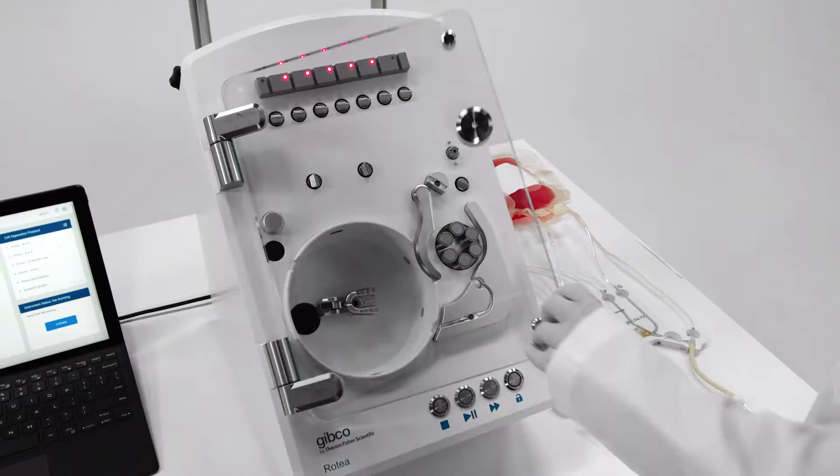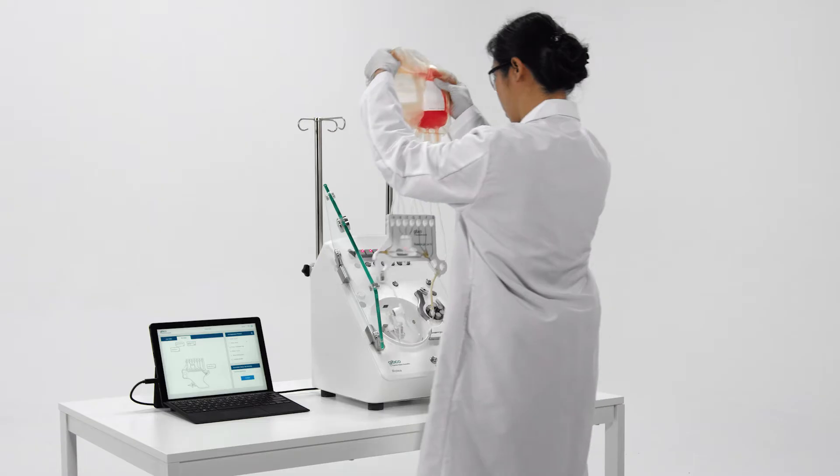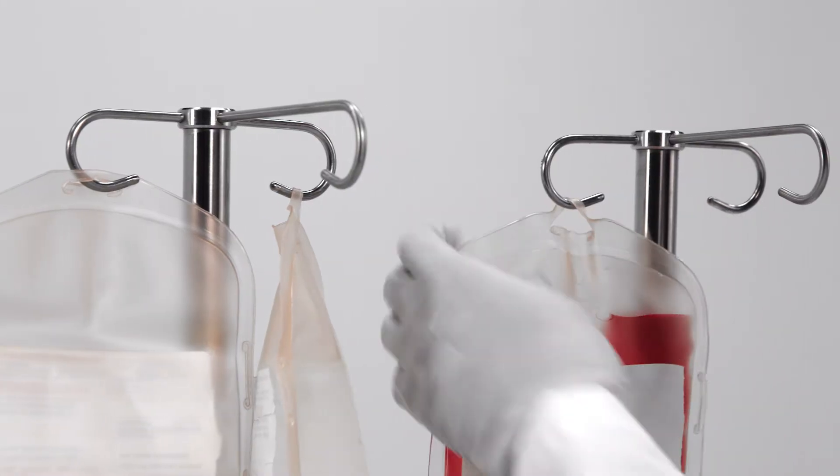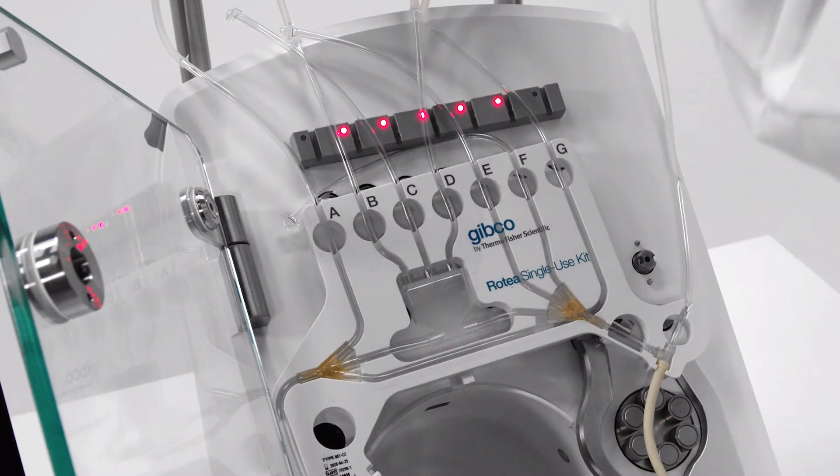Third, load the single-use kit. Start by hanging the bags in an order that best lines them up with the tube ports on the bubble sensor strip.